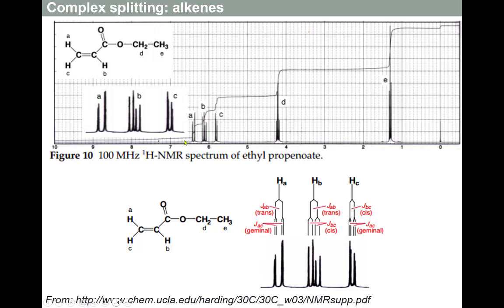But now what's going on over here? These are the alkene protons. Technically, these are 3 different protons based on our testing. They're non-equivalent, but they're close.